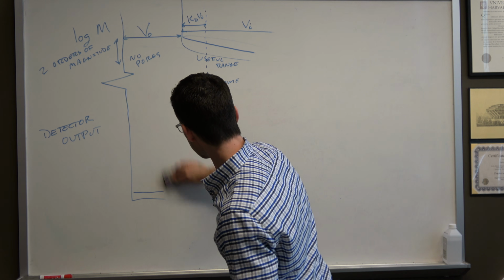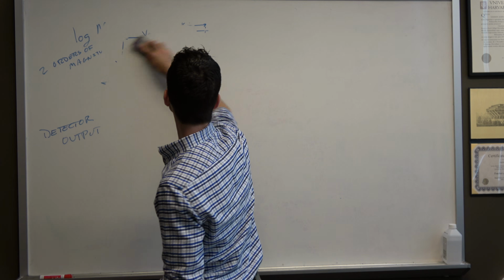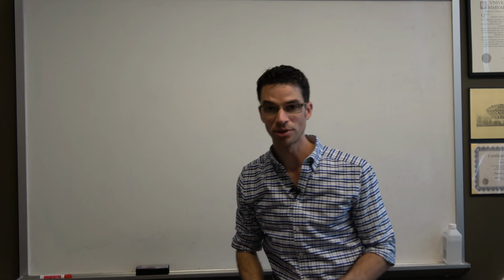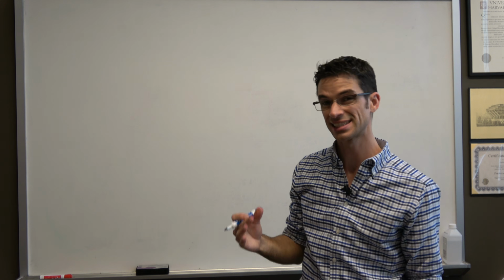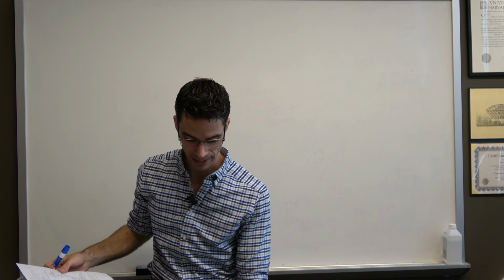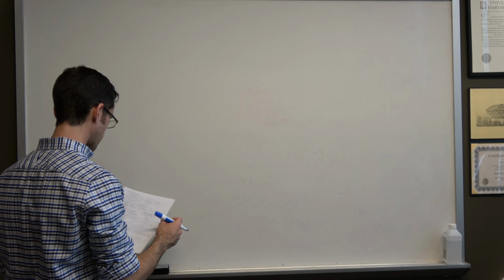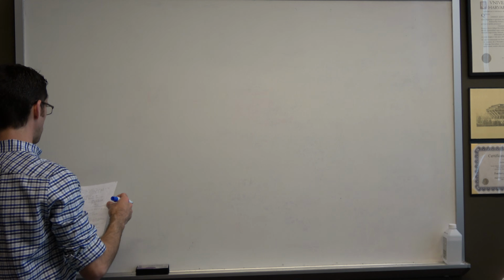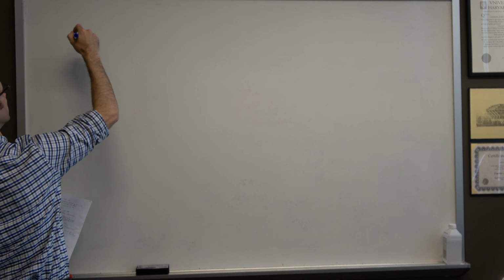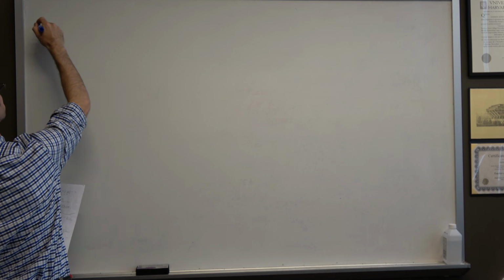Now this seems simple, right? It should work every time, but it doesn't, because polymers do not always have easily predicted hydrodynamic volumes based only on molecular weights. So sometimes they could be different from our standards. So remember that the separation is based on the hydrodynamic volume, not the molecular weight.